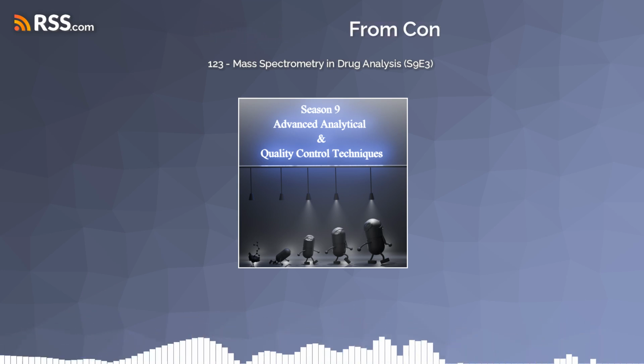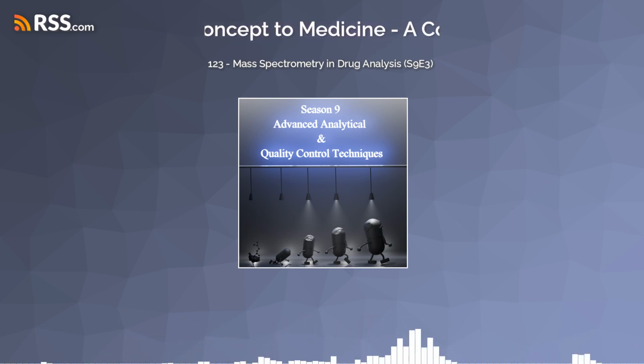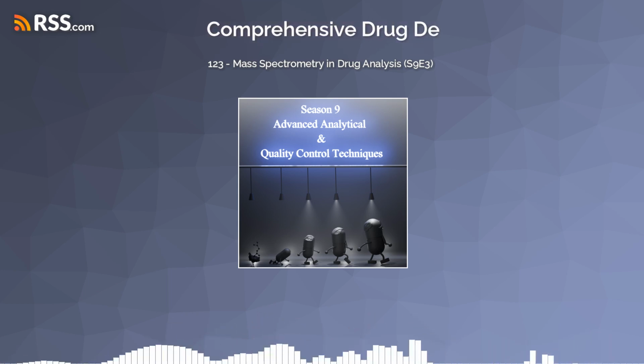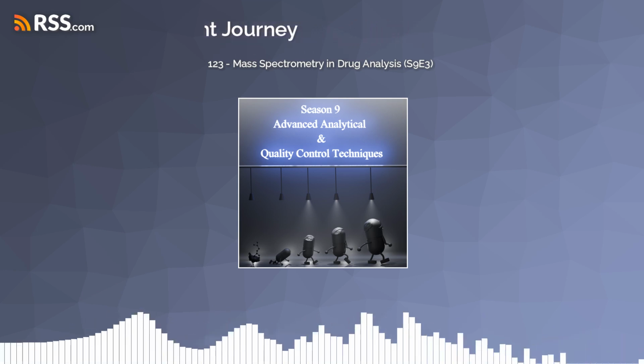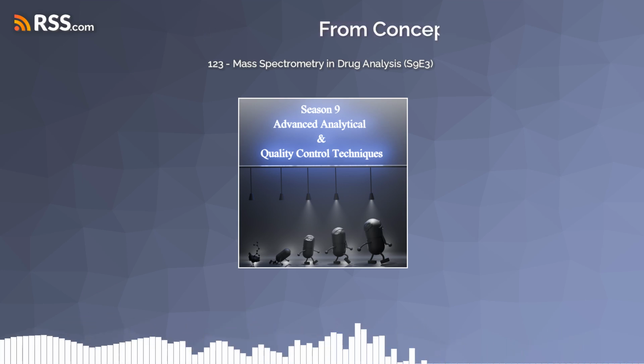When we analyze drug substances, it's not as simple as just confirming that the main ingredient is there. Mass spectrometry helps us generate a super detailed molecular profile. Think of it like a unique fingerprint for that specific batch of the drug. So like we can tell not just that it's an apple, but what kind of apple, where it was grown, the whole story. You got it.